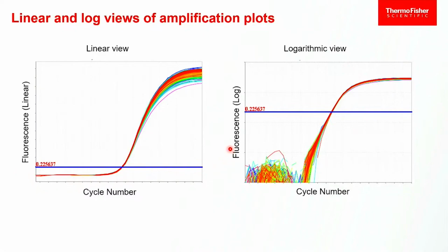So if we plot it on a log scale, we can expand that region of high twofold growth. When we look at it on a log scale, what we're looking for is this nice straight portion of the graph. If we have a twofold growth process, plot it on a log scale, it becomes linear. And again, we get to a plateau phase out here.